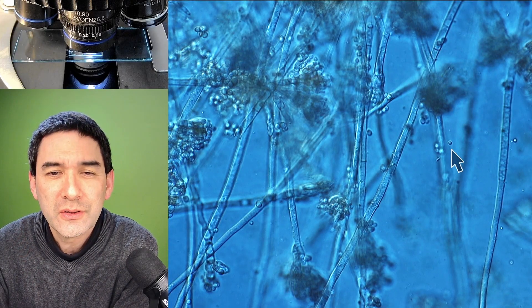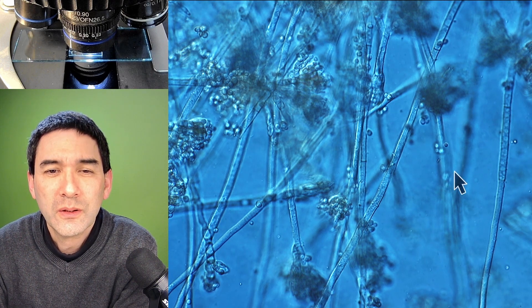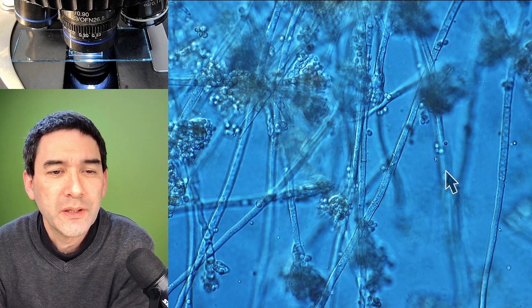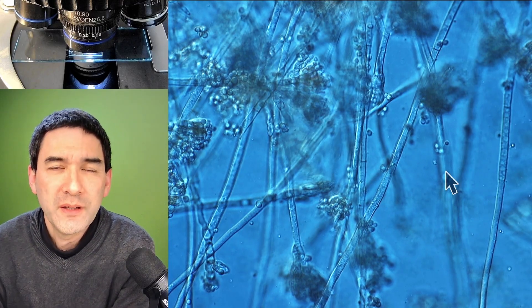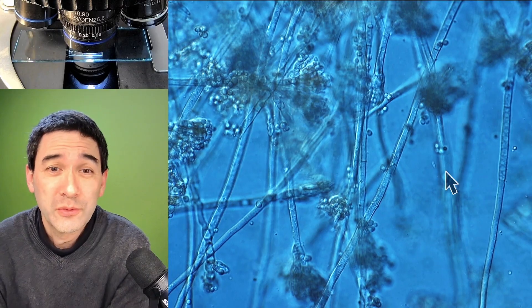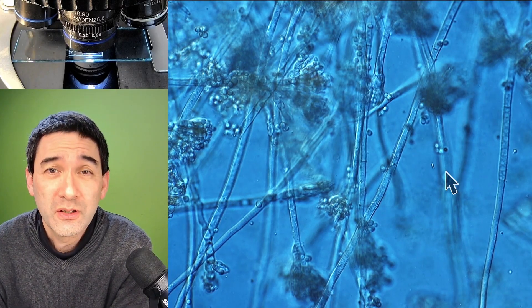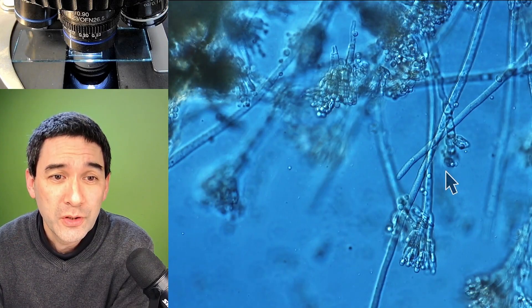Have a look at those tiny dots here. Especially this one over here, and maybe this one over here as well. Well, these look very much like bacteria. Very often it's like this — when some food becomes moldy, it's not only a fungus, not only the mold that you're able to see, but usually there is quite a bit of contamination with bacteria present as well. And that's basically what we have over here.